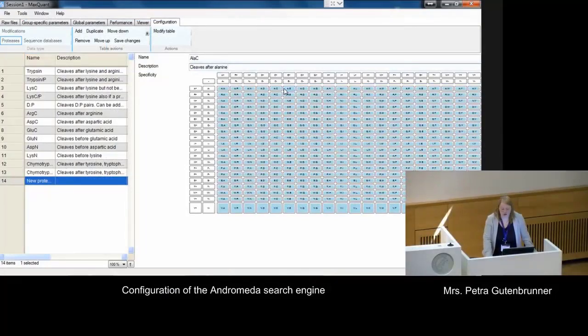It's not activated, so you can't click on add? So there is a hidden button. Maybe you can click discard changes. So if it's locked and you can't press any buttons here, then when you click on this arrow here, maybe you click discard changes and then it's possible. Does it work? No? Yes? Nice, good. Okay, now we want to define here the cleavage rule.